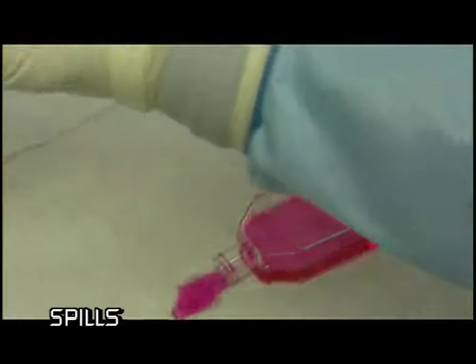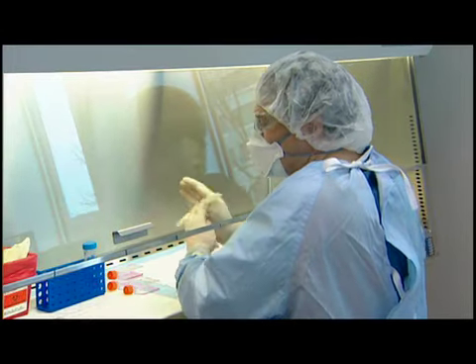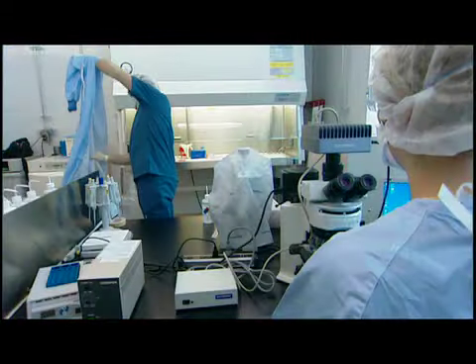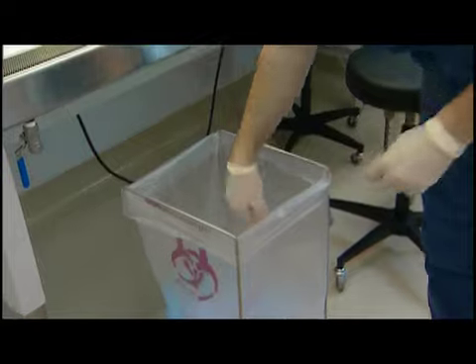If there is a spill within the biological safety cabinet, leave the BSC turned on and let the aerosols settle before disinfecting all objects in the cabinet. You should also change your gloves and protective gown before cleaning up.